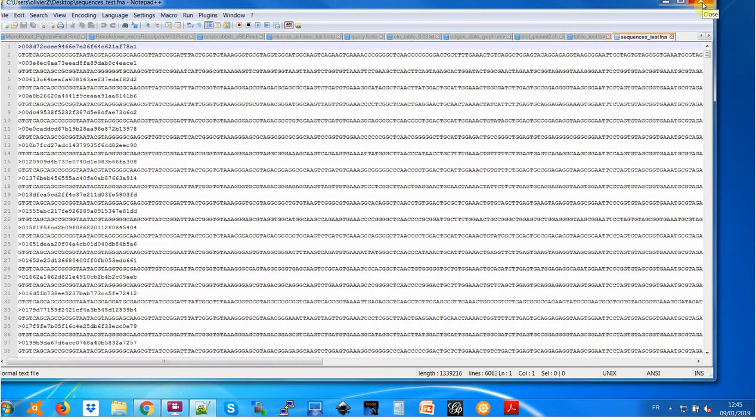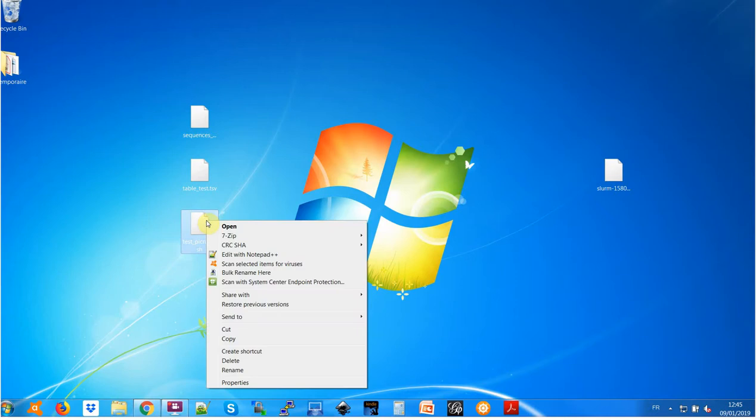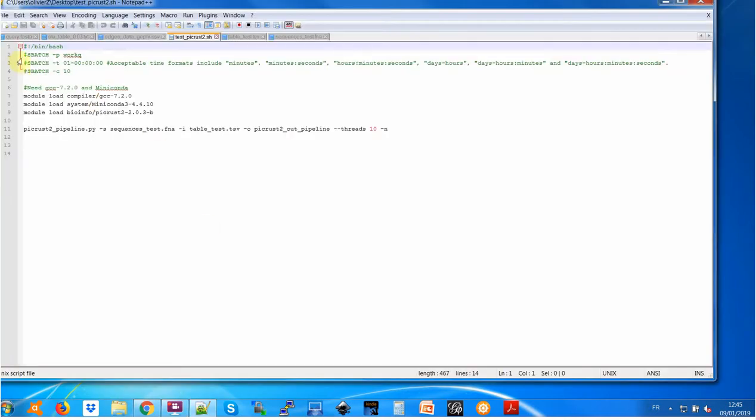you may want to convert this table of OTU into a table of KEGG orthologs, and that's what we are going to do now with the help of this little file which was given to me by Caroline, and I can open it. See, it's very simple.